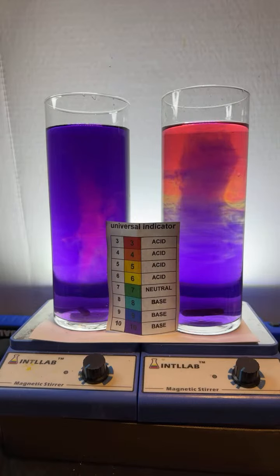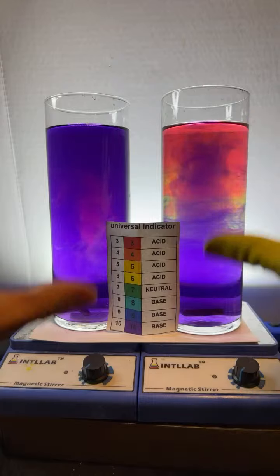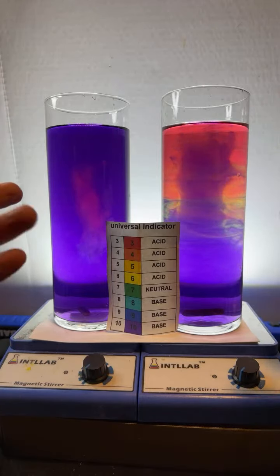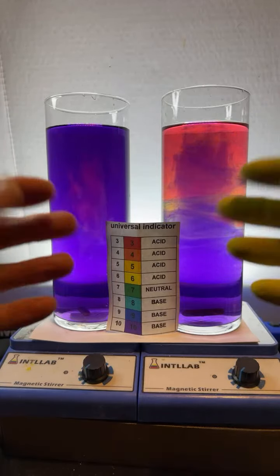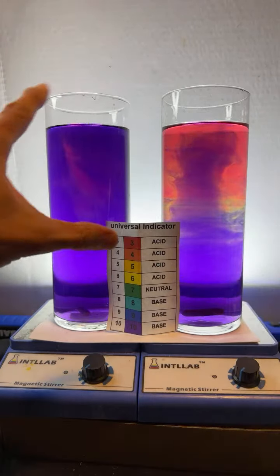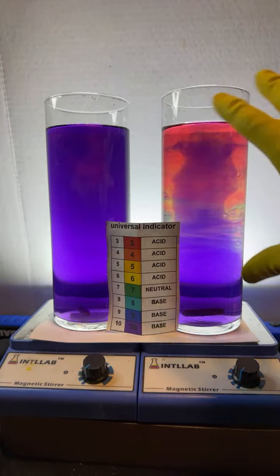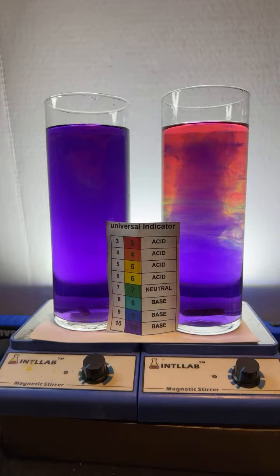It's really beautiful. And you can see the whole rainbow in there. I kind of like this because when it's spinning fast, the acid and base homogenize very quickly. And so this reaction happens very quickly, and the solution homogenizes to a particular pH very quickly. But when you turn it off, you see these different pH regions that persist.